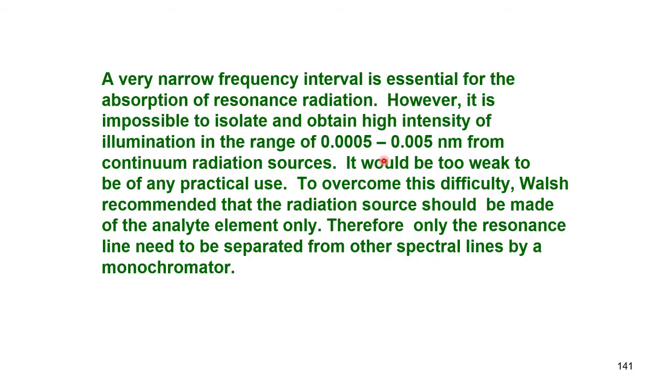What Alan Walsh said is, you make sure that it is not the heated filament that radiates, but you must excite the electrons to the next higher energy state and let that come out from the lamp, and that will be of single wavelength, or it may contain only 3 or 4 resonance lines. So, that was a revolutionary idea which made atomic absorption a very versatile technique.